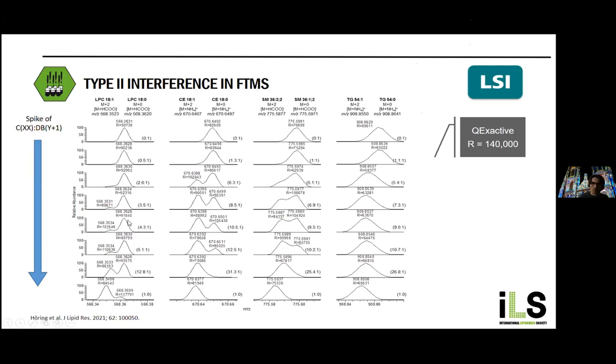Here it's an Orbitrap used here at 140 K mass resolution, and this is at 200 m/z, and this is sufficient, for instance, to resolve here the LysoPC 18:1 and 18:0. In this experiment, Marcus from our lab did a spike experiment. He added here the 18:1 in increasing amount, and you see the peak is rising, but we get some kind of separation of the saturated LPC species.